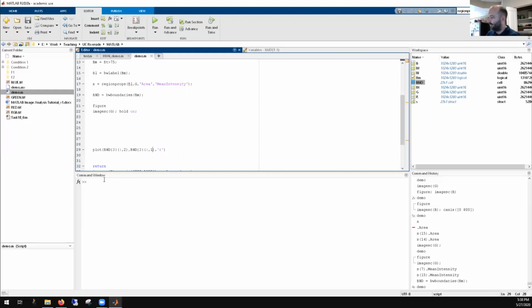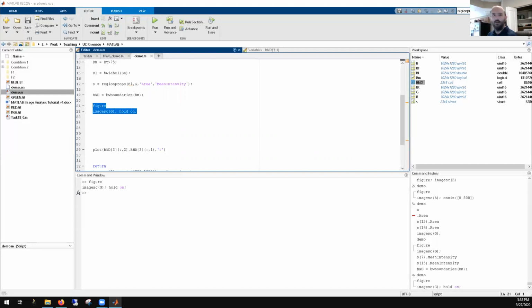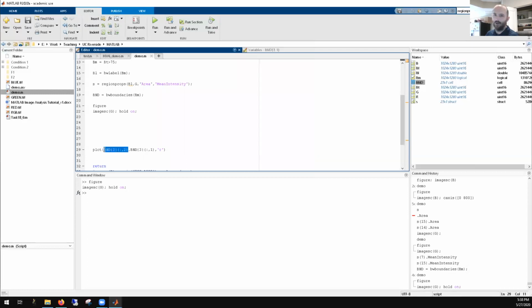But if you think about the way, let me pull up an image. Oh, we don't have an image. Let me display one. If you think about this, the columns of the image are vertical. Obviously, they're columns. So X is changing the columns, and Y is changing the rows. And MATLAB always goes rows, then columns. So our X is our 2nd column because it's the 2nd index as far as MATLAB's concerned. So it's just a weird way of thinking about images as matrices.